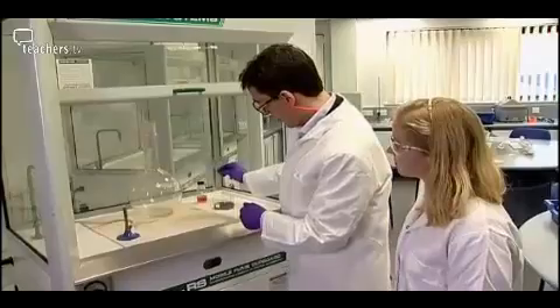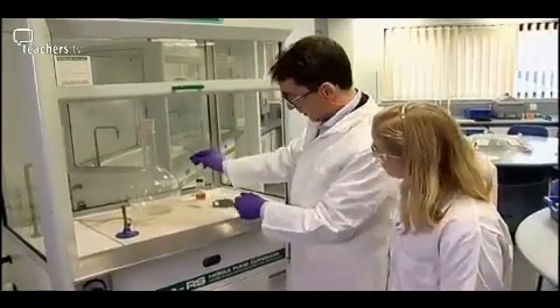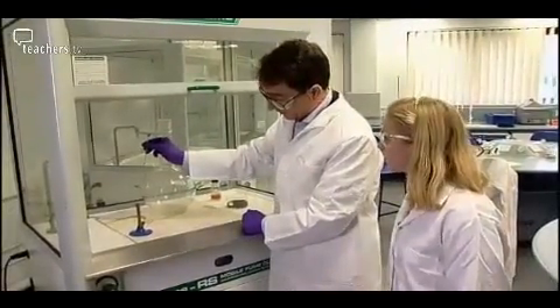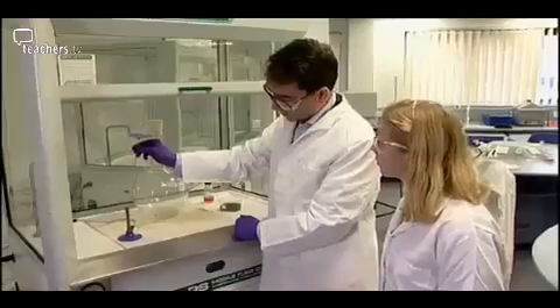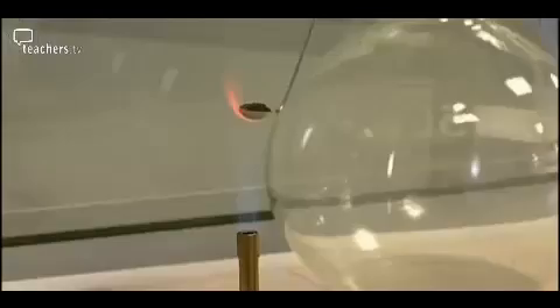Now here's the best bit. I take the deflagrating spoon — I hope you can see that — and I've got the chromic oxide flakes on the end there. Then I heat them up in the flame. You can see some of the flakes just popping off the spoon. This is the trick of this experiment: these hot flakes, because they're so light, they float around. And when you think you've got it nice and hot enough, it's into the flask.